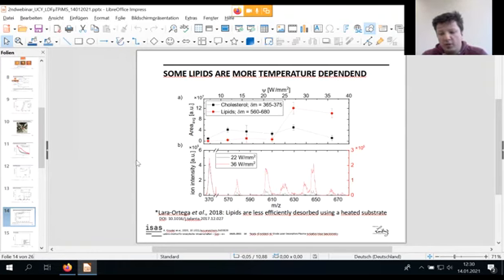This method is called temperature programmed desorption. It is usually done, as I said, with gases such as nitric oxide, but it might also apply to even more complex substances. So this might be an interesting field to test in a controlled atmosphere like David presented, but with very low partial pressure to control the rate of desorption.